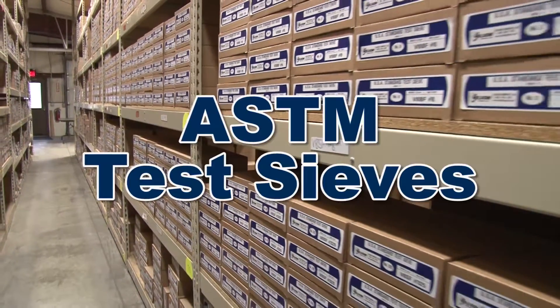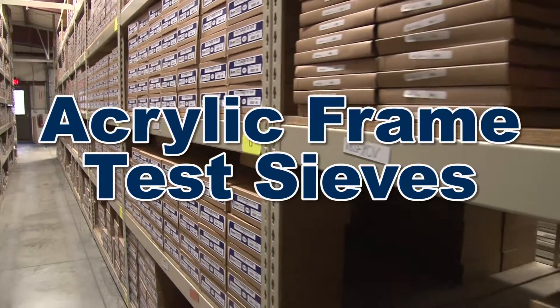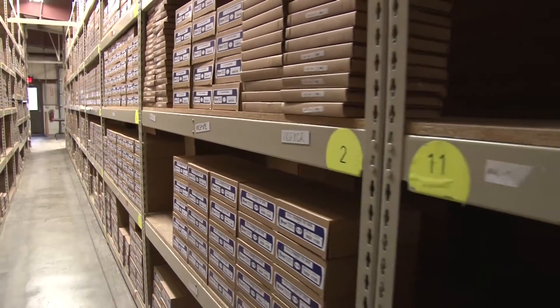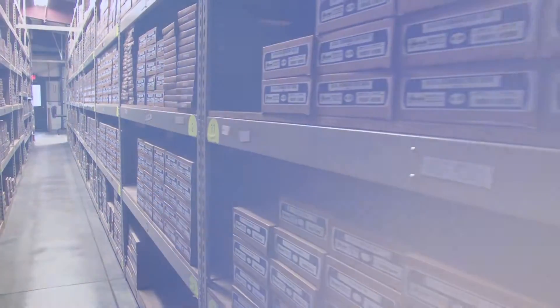Whether you need ASTM test sieves, ISO test sieves, acrylic frame sieves, precision electroform sieves, or any number of specialty sieves, Gilson sieves are ready for immediate shipping or fast custom order delivery.